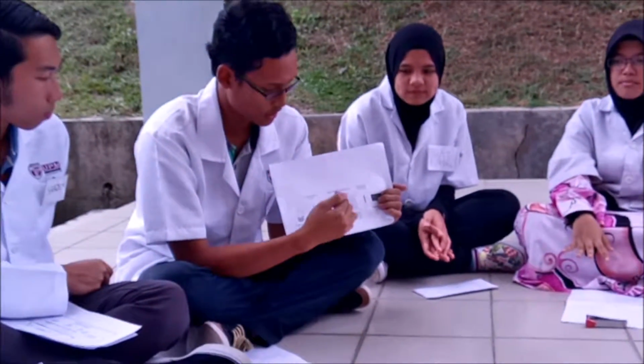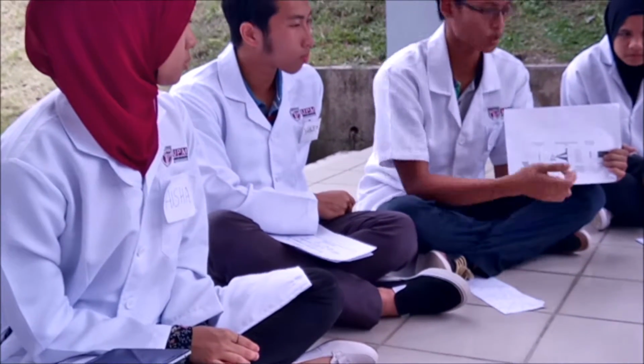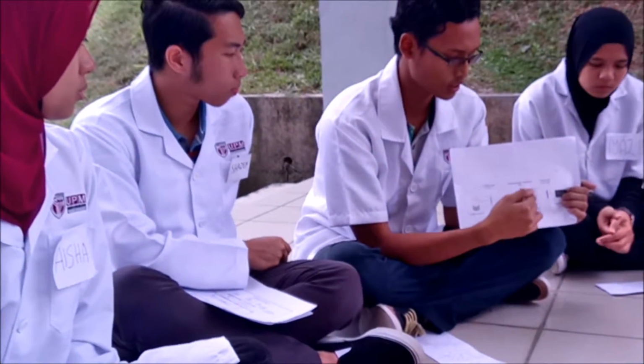After that, this selected light will pass through the sample solution. For example, if we want to use hemoglobin, if the light is red, it will transmit the red color. But if we use green color, the hemoglobin will absorb the green color.